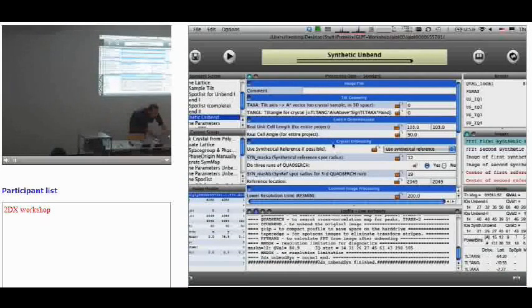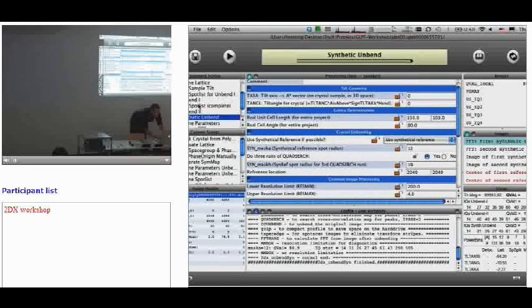And we do this because we run 2 searches of quad search. The first one determines the rough lattice distortions, and the second one refines that error profile with a smaller reference, allowing only small deviations. And so if you run this, you generally improve the resolution, as Angie explained.